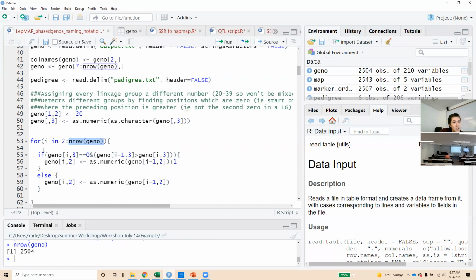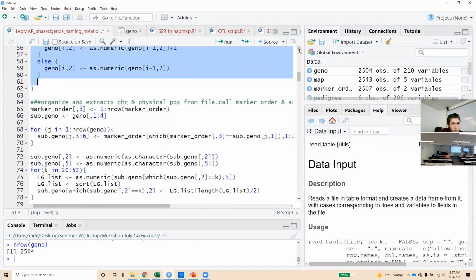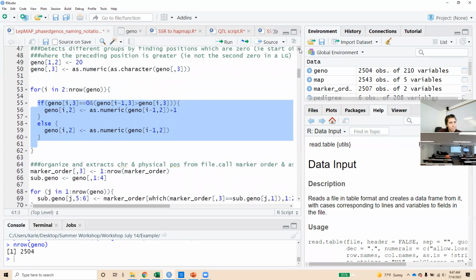So it'll do these functions in here that many times. So they read a row first, and then they refer to every single column. It's basically a way to apply functions and stuff to each cell at a time, since I've defined the row numbers for these.